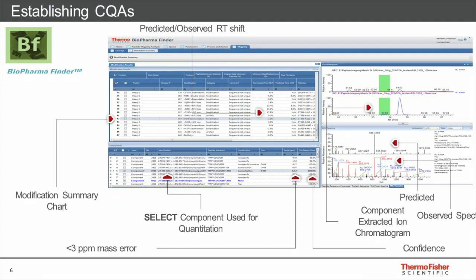How does it know that it's this peptide sequence? Well, what it's done is it's used a kinetic model to predict not only which fragments you'll see, but also their relative intensities. So this is another layer of confidence. It's not only saying, yes, you'll see Y12, it's actually saying you'll see it as the most intense, at 2+. And if you look at the observed spectra here, it's a really good match to the theoretical fragmentation pattern. So I'm convinced that this is the peptide, but how do I know it's the ISO-D?